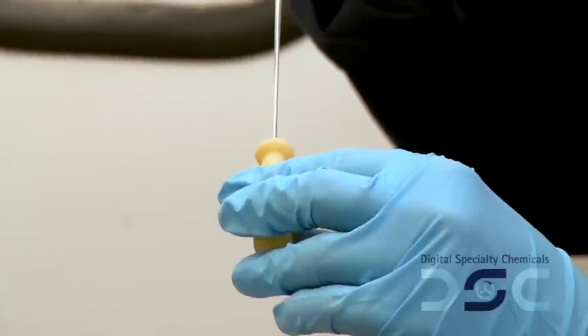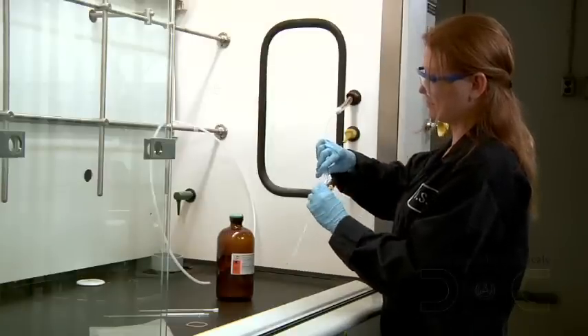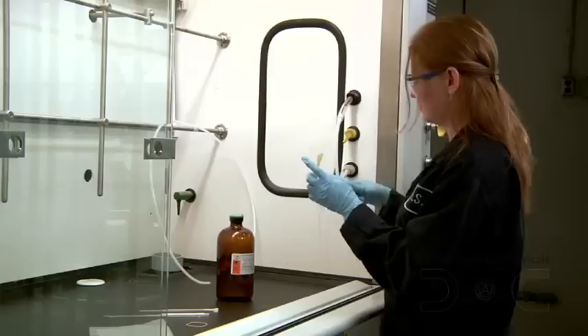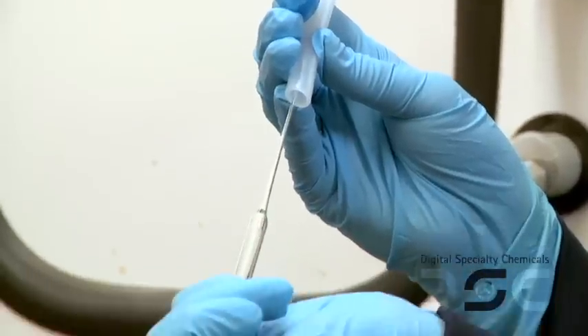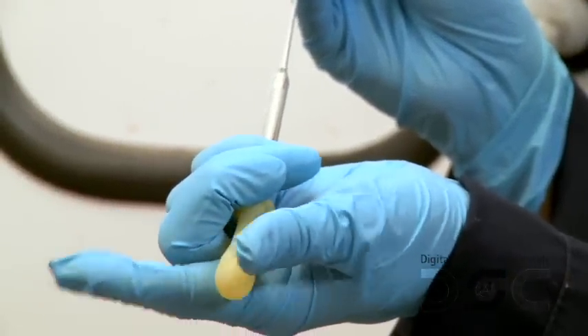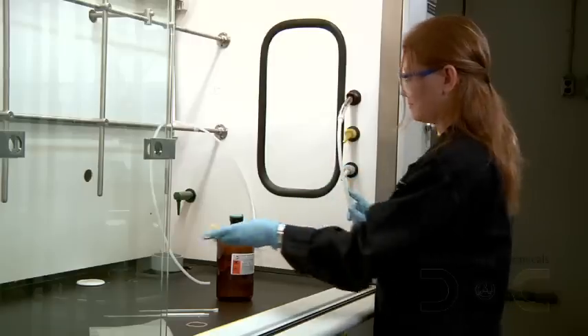Next, purge the pipette bulb. Remove the pipette from the nitrogen line and quickly put the bulb onto the wide end of the pipette. Insert the tip of the pipette into the nitrogen line with the nitrogen flow on and push nitrogen in and out three to four times. It's important to note that the pipette should be used promptly.